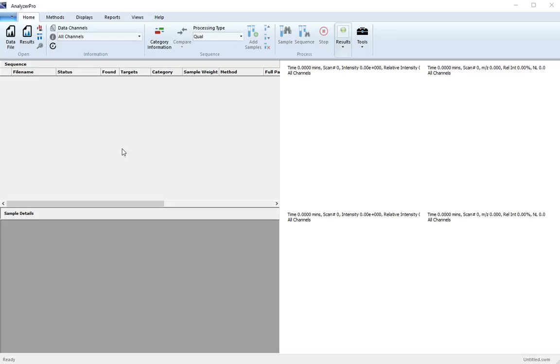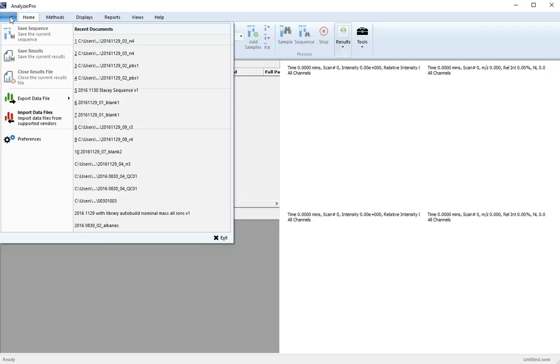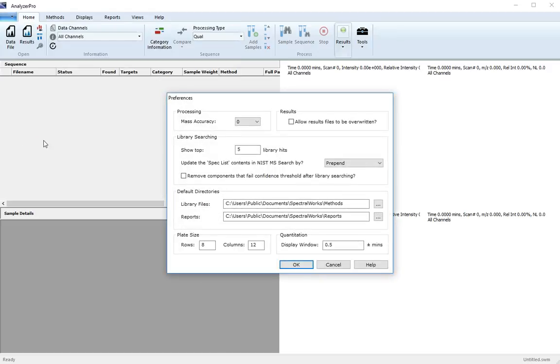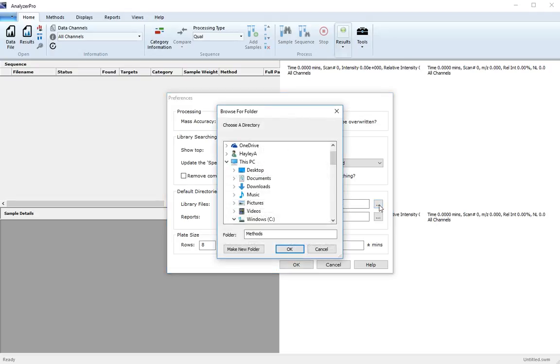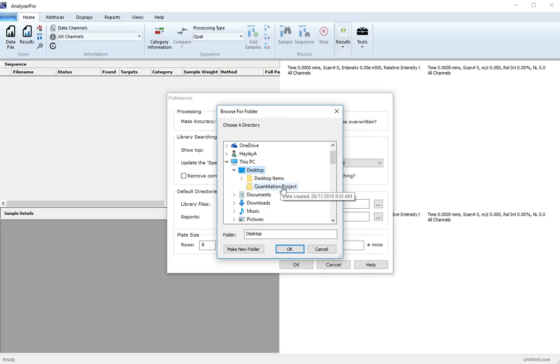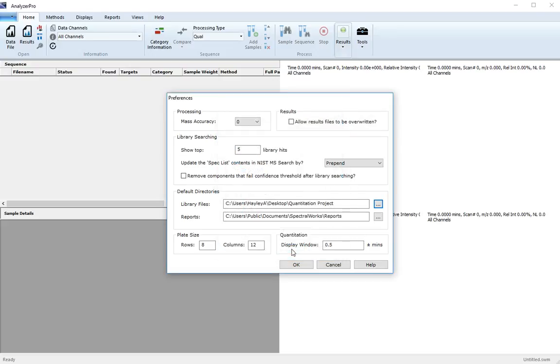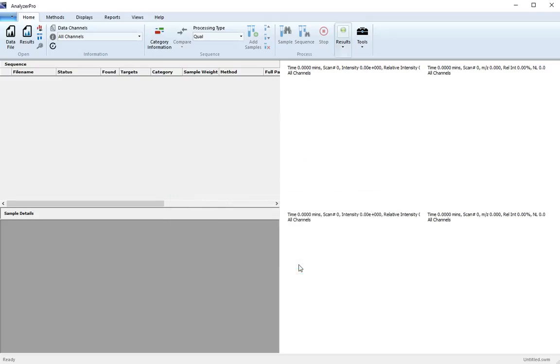Start by setting your preferences. Using the application button, scroll down to preferences and define the location where you would like to save your method and library files. I've saved the example data to a location on my desktop. Click OK and now open your data files.